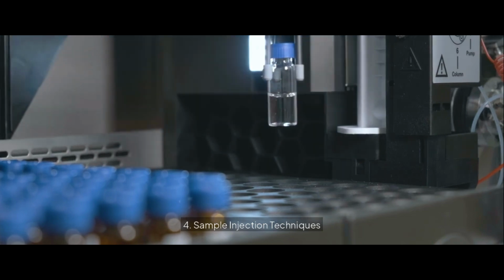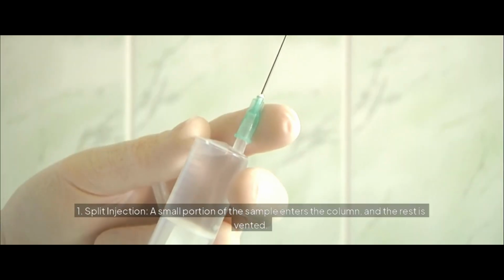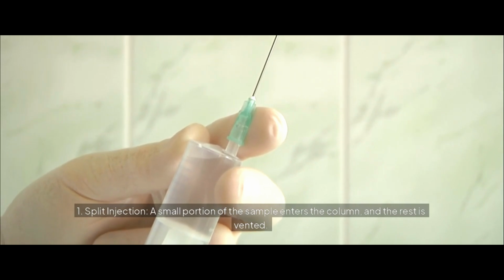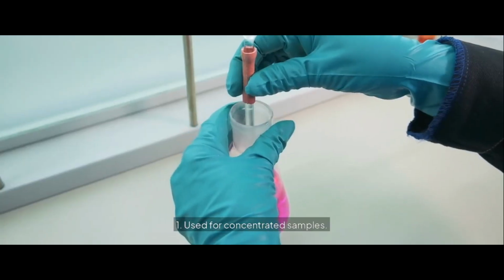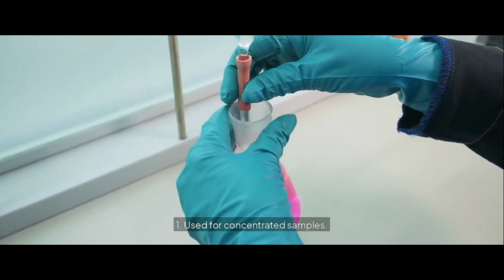4. Sample injection techniques. 1. Split injection, a small portion of the sample enters the column, and the rest is vented. Used for concentrated samples.